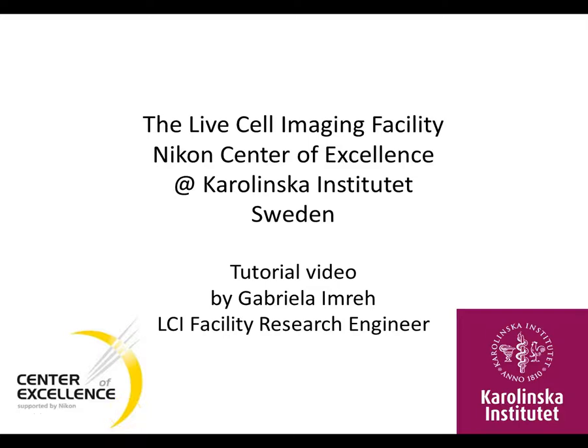Hello, my name is Gabriela Imre and I'm working at the live cell imaging facility at Karolinska Institutet in Sweden. In this short video I will show you the easiest procedure for cleaning your cover slip before seeding your cells on it.